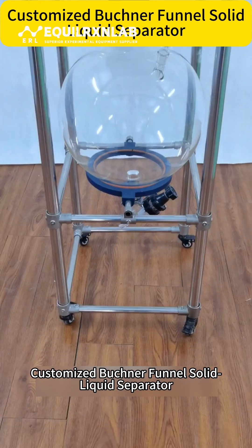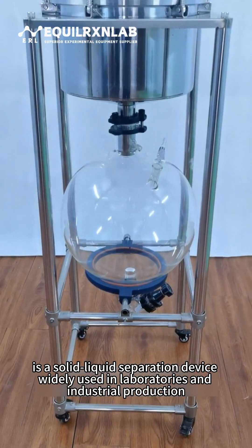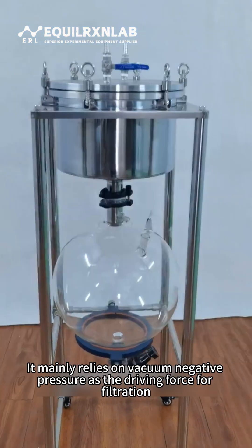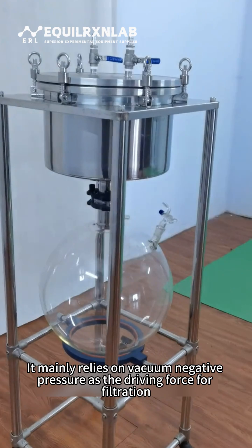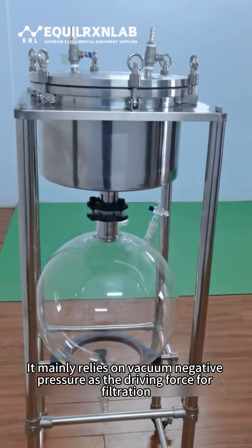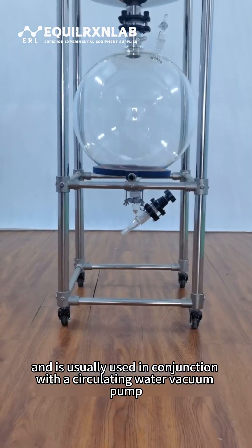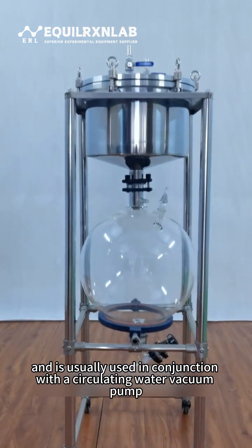The Customized Buchner Funnel Solid-Liquid Separator is a solid-liquid separation device widely used in laboratories and industrial production. It mainly relies on vacuum negative pressure as the driving force for filtration, achieving efficient separation, and is usually used in conjunction with a circulating water vacuum pump.